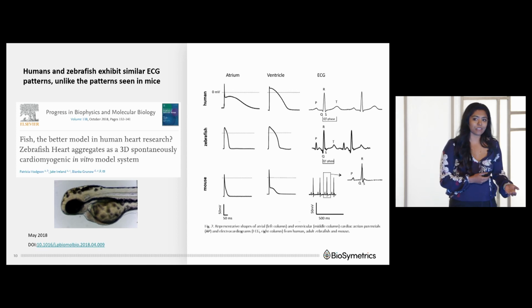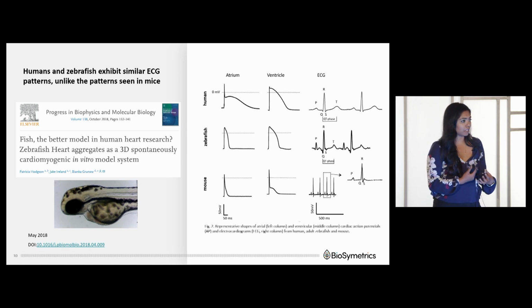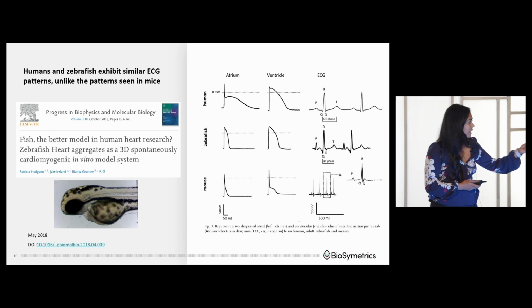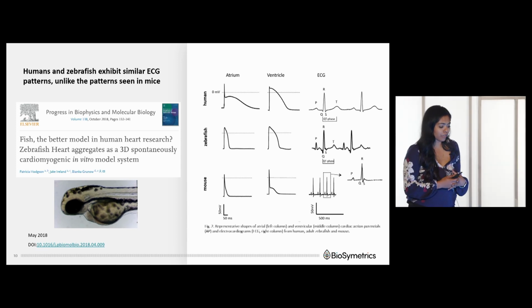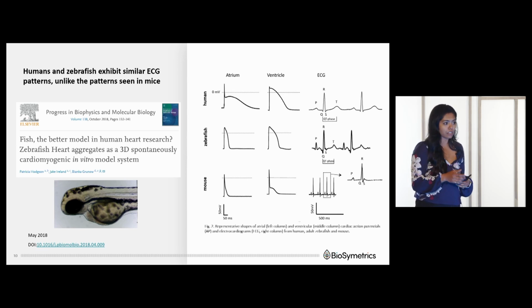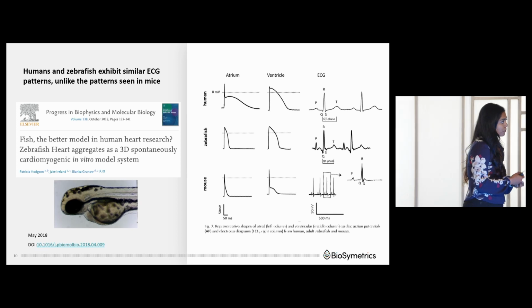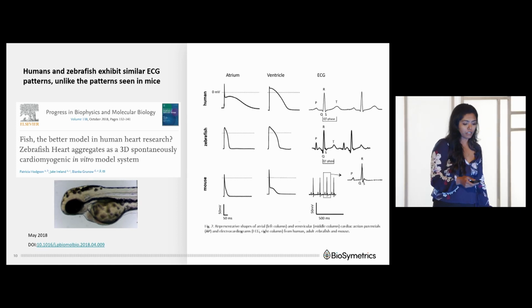Unfortunately, we cannot do this with zebrafish. So the way we actually compute the heart rate is by looking at the video itself. So the video there is just a high-resolution video of a healthy zebrafish, and you can see that there's some pixel intensity changes in the heart area, and that is basically what we quantify. So we look at the pixel intensity in combination with Fourier transform to produce an ECG. And again, I'll go into that in more detail later on.